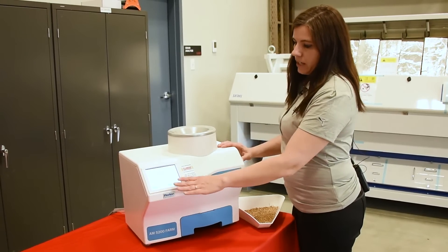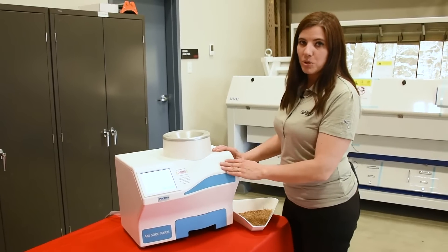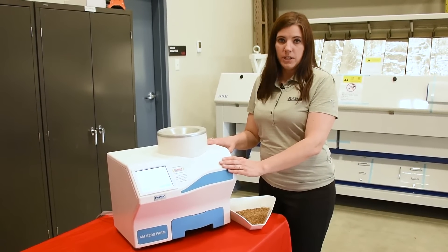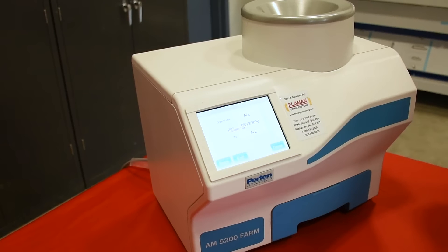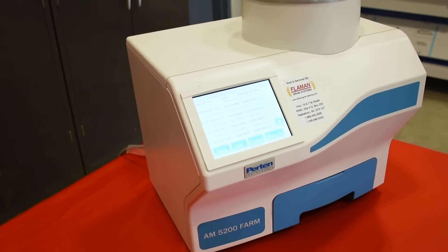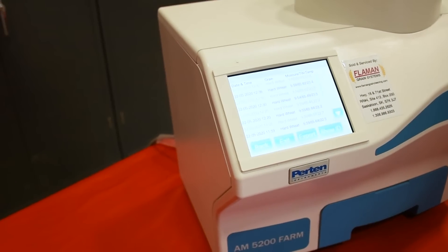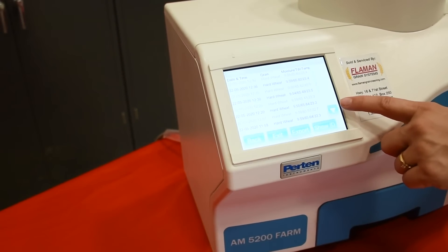Any kind of updates are done by a USB stick. You can import or export any kind of data that you need onto the meter, and it's quite easy to do. The meter will display any kind of results that you have done, and it'll keep a record of all the results displayed on this machine.